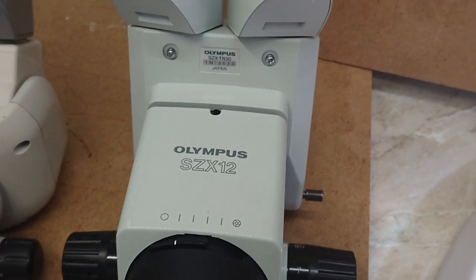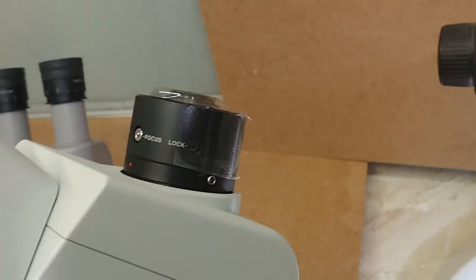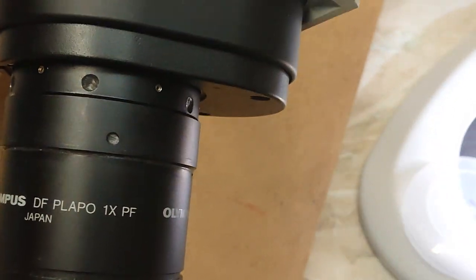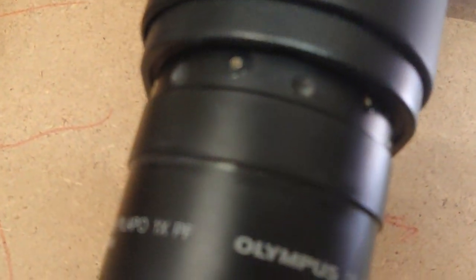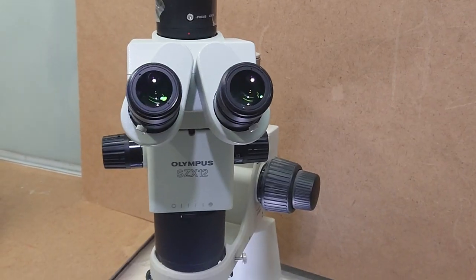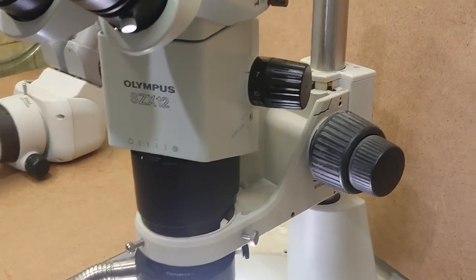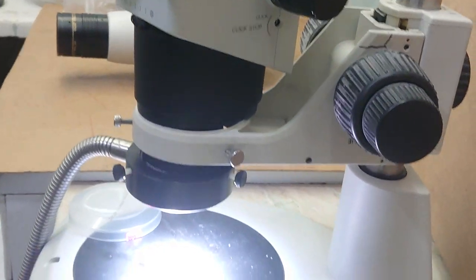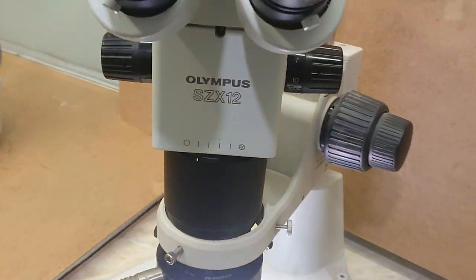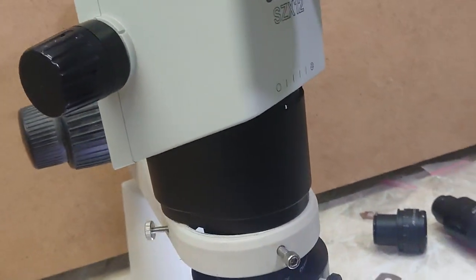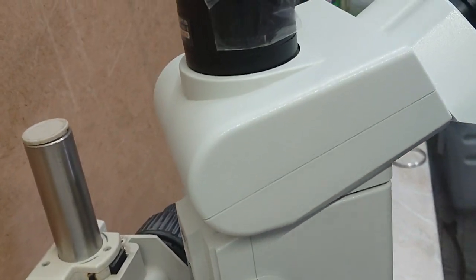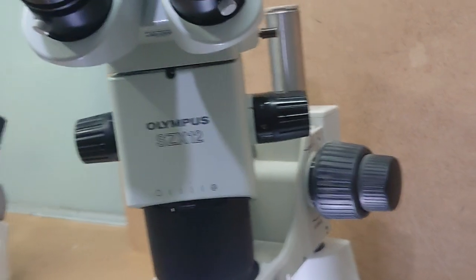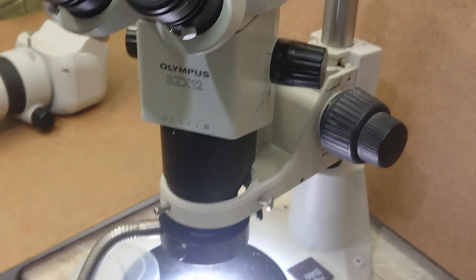Very cool Olympus SZX12 microscope with trinocular head and with very nice DF Plan Apo objective that I tuned a bit because it had very bad quality. So let me change microscope. We have got our Olympus on a stand. Now let us look around how it looks like. I haven't got its original focuser, so I'm just putting it on the collar, not properly, but it won't distract us from getting proper results.